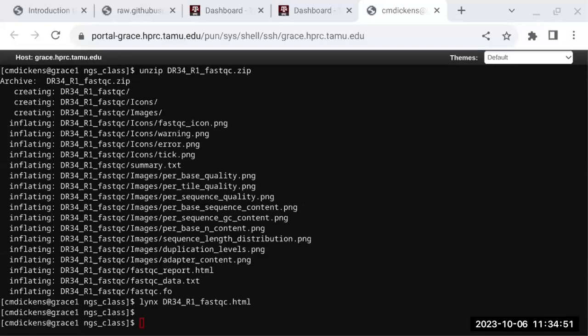If the second read is trimmed to 50 bases and we have a minimum read of 40, these get put into the trim file, pair 1 and pair 2. But if this one gets trimmed to 20 bases and our minimum length is 40, it gets thrown into a different file, single end reads, because you lost this pair, you threw it out.